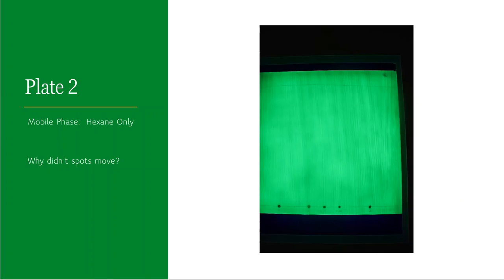Yeah, pretty boring, isn't it? It looks like all the spots that I did, it stayed down there at the bottom. Nothing moved. And I kind of alluded to this a little bit early on. So this is just hexane only. That's it, nothing more. And it looks like hexanes didn't do squat to move those spots up that plate.